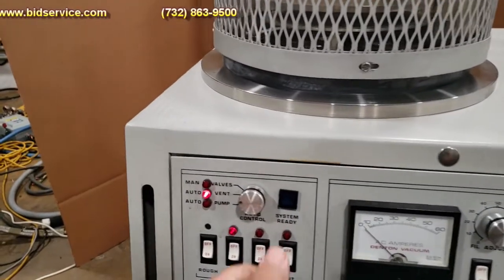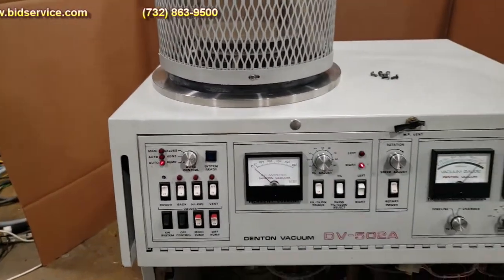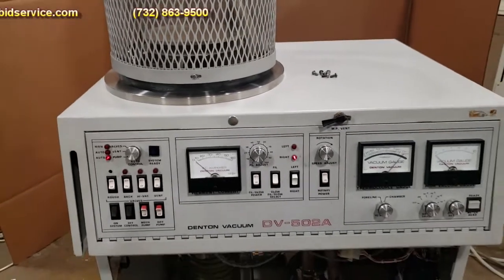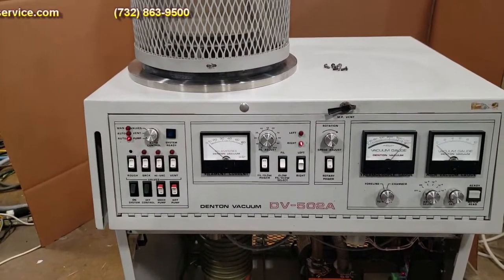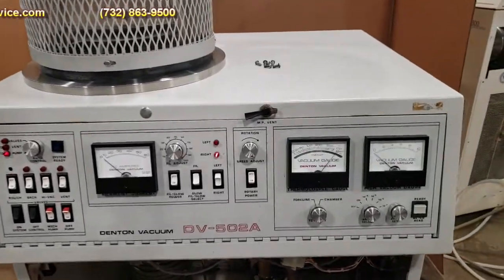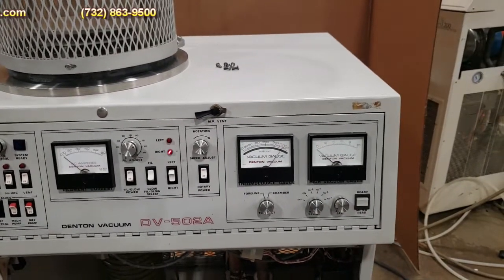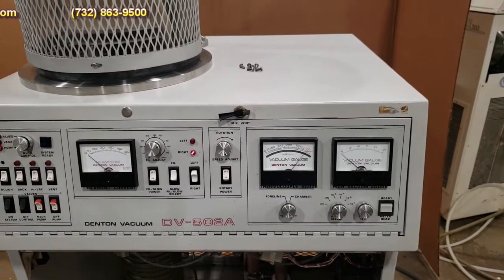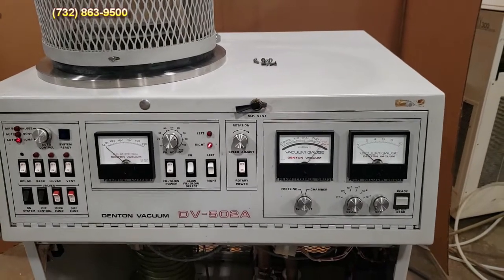And then all you've got to do is just flip the switch to pump. As you can see, it changed over to roughing right now. You can hear the pump laboring. We'll wait for the chamber pressure to get around 50 millitorr - sometimes it's around 35 - and then we'll do the crossover to HiVac.